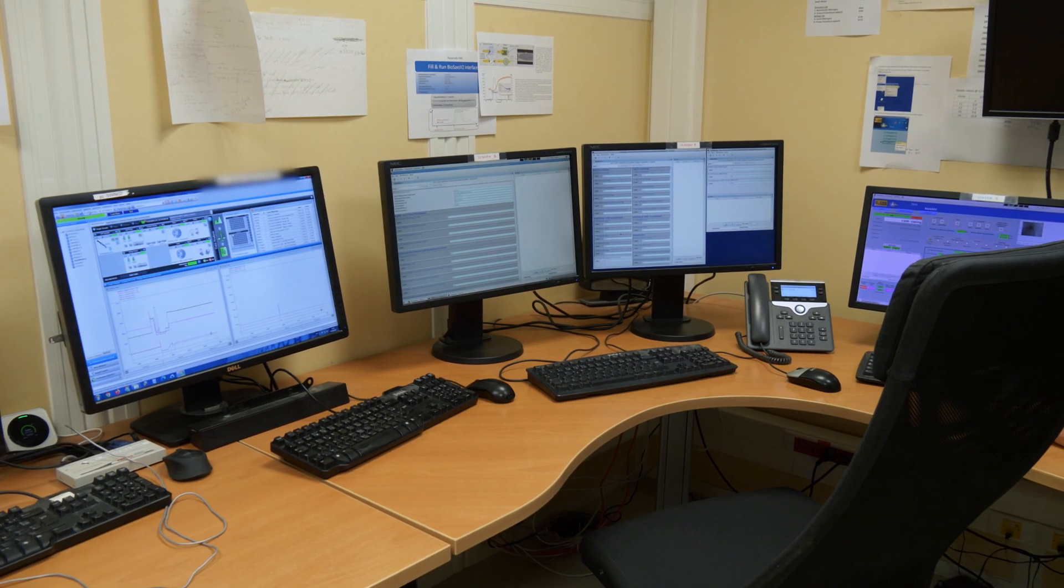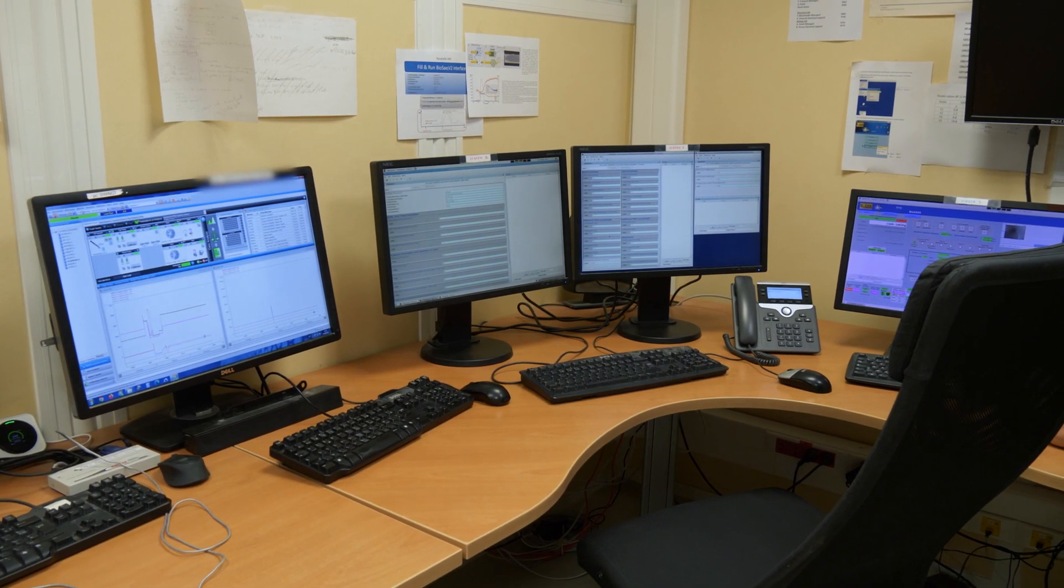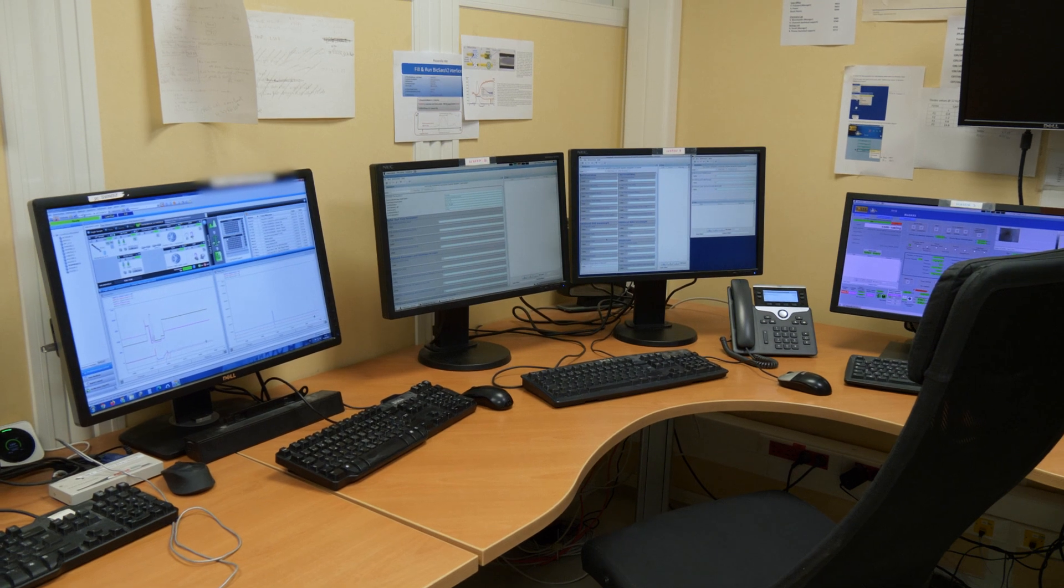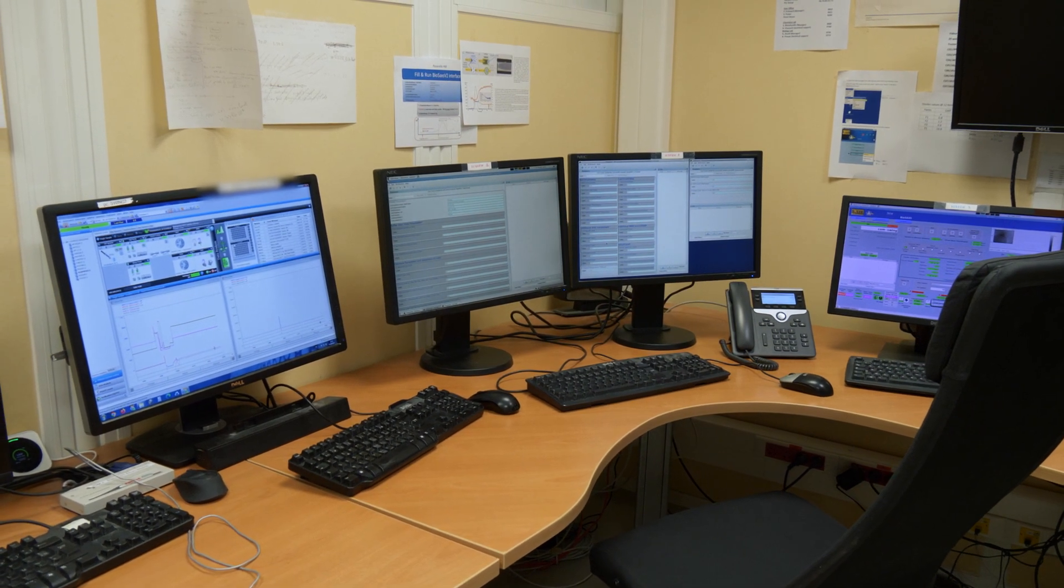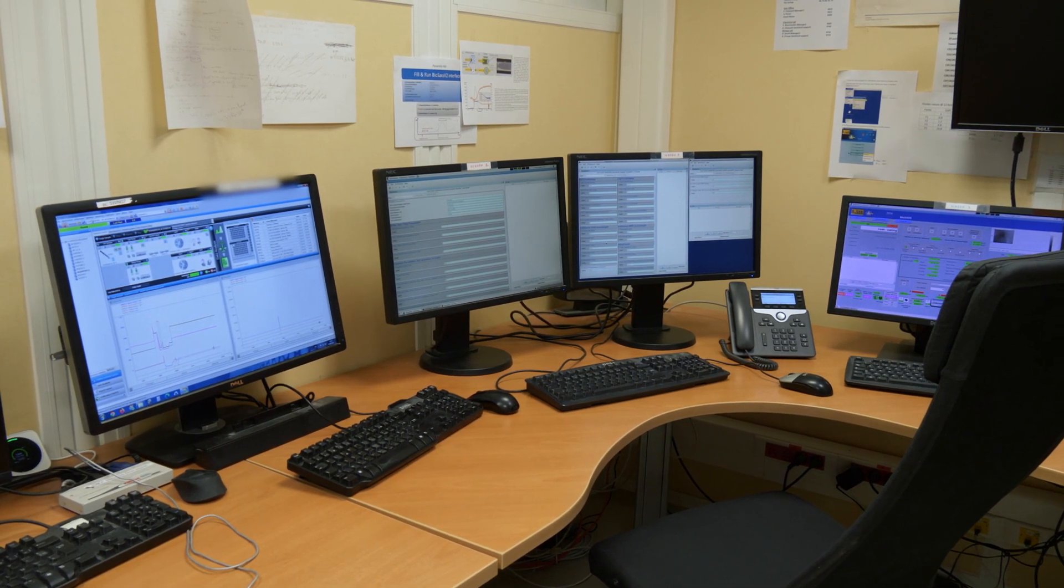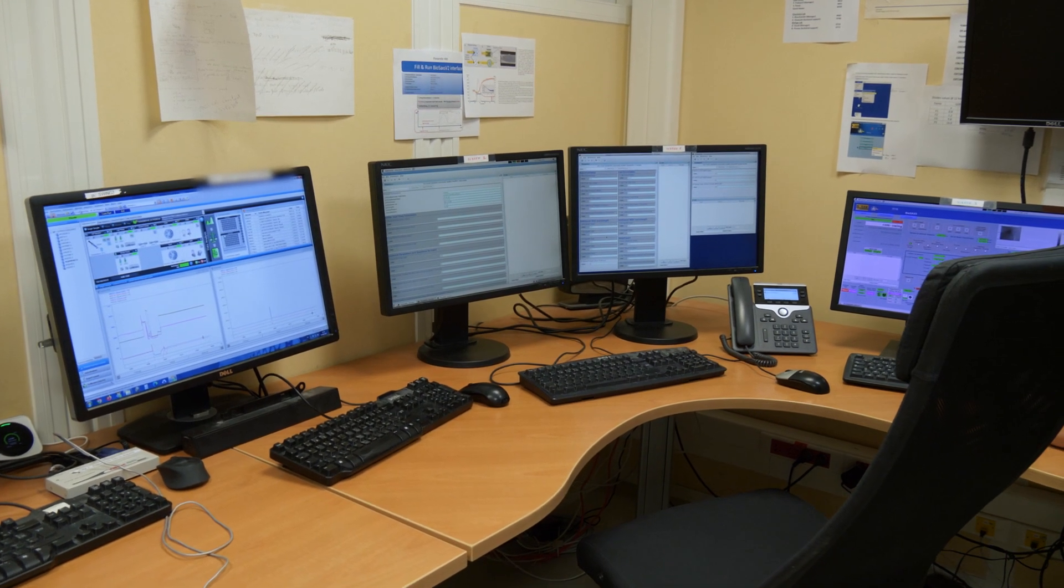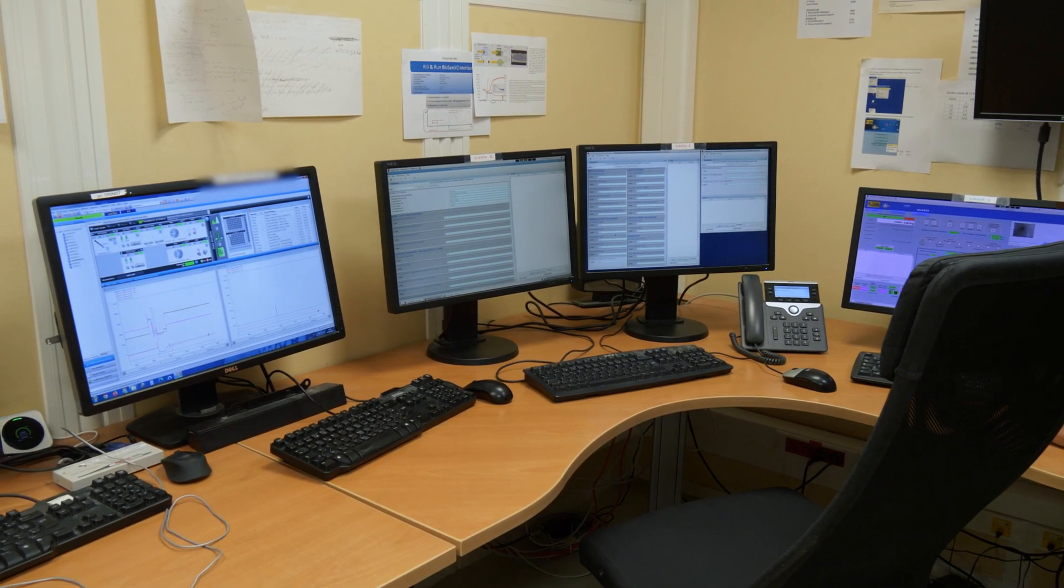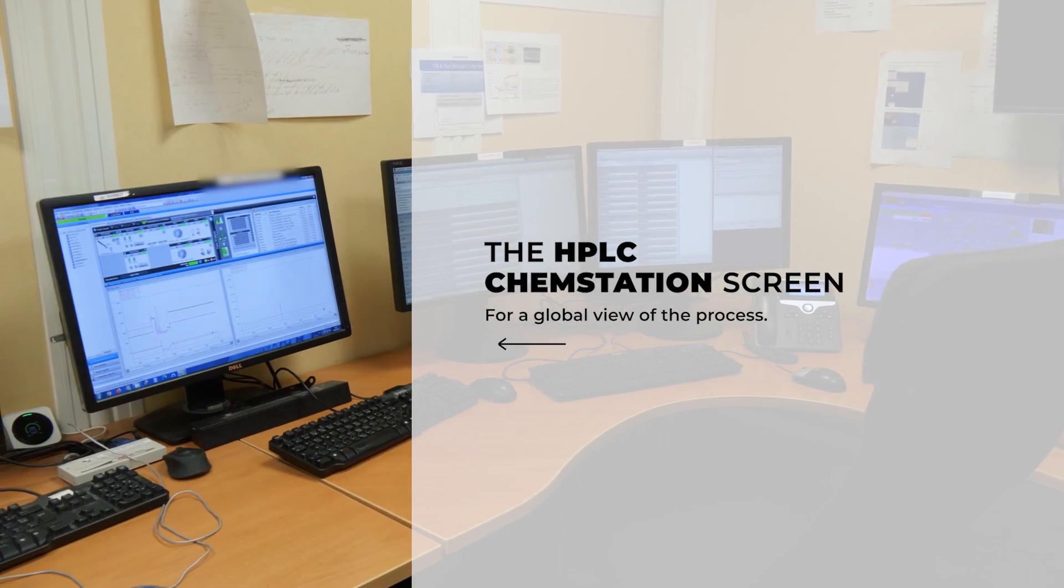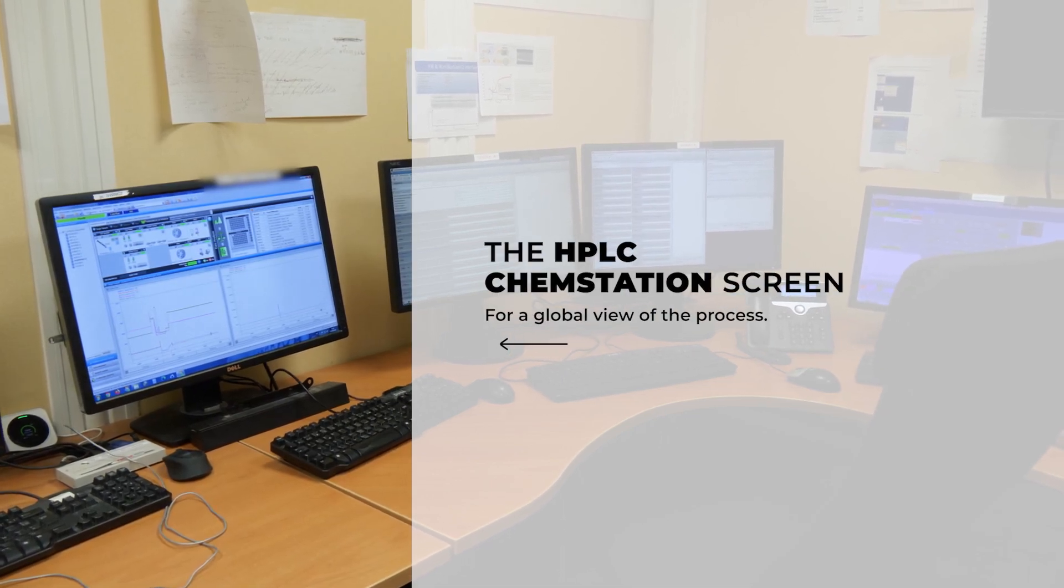Welcome to the control room of the SWING beamline. The monitoring and control of the purge of the columns during the SEC-SAXS experiments can be done via these two screens: the HPLC ChemStation screen on the left for a global view of the process, and the SEC-SAXS setup screen on the right.